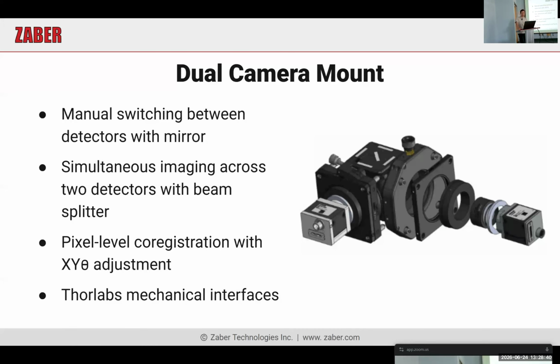We do multi-camera, which is a pretty common use case for wanting to combine multiple types of cameras. So if you have visible spectrum and infrared, seeing the surface and then looking for subsurface defects in a wafer. Or, I know we've had people use a standard camera and an event-based camera, or you could put a SPAD sensor on there, just mixing and matching.